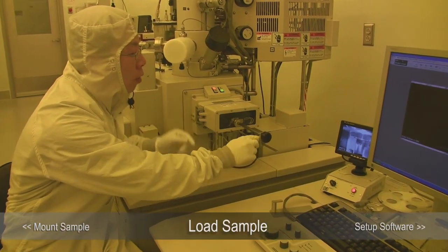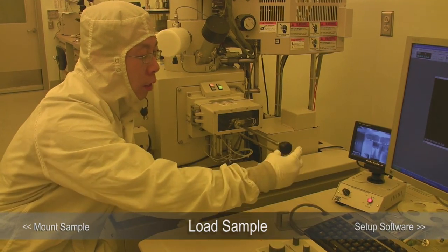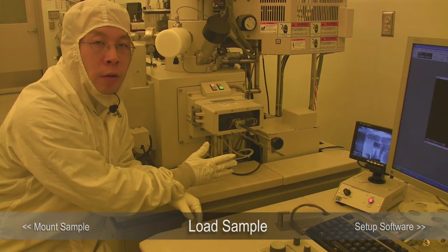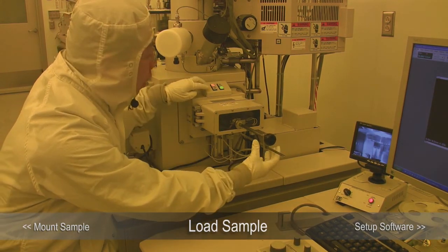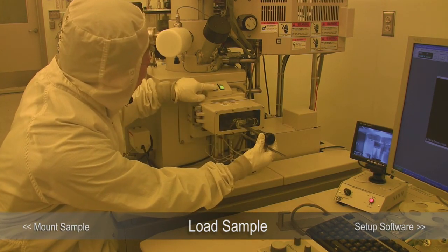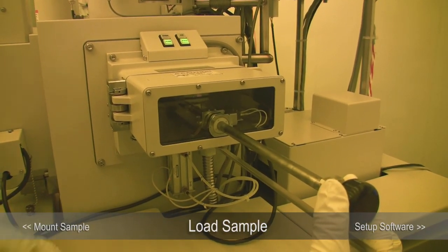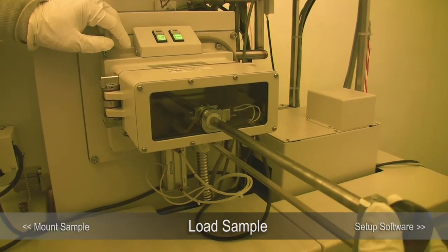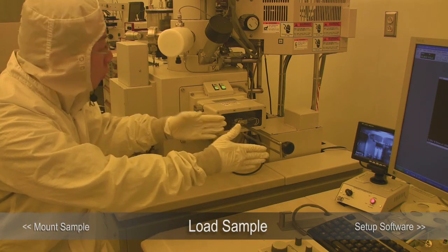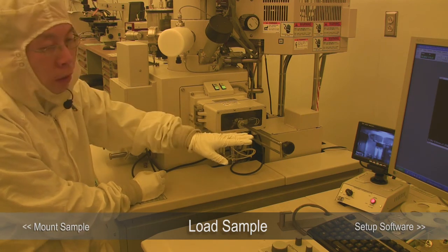After we load the sample, we pull the exchange lock out — make sure you pull it all the way out. If you don't pull it all the way out, the vacuum will suck it in. When you try to close the gate valve, if the exchange lock is not all the way out, it won't let you close it. You have to wait until you pull it all the way out, then the gate valve closes. This protects you from having the exchange lock caught in the gate valve, which would damage both the gate valve and the exchange lock.